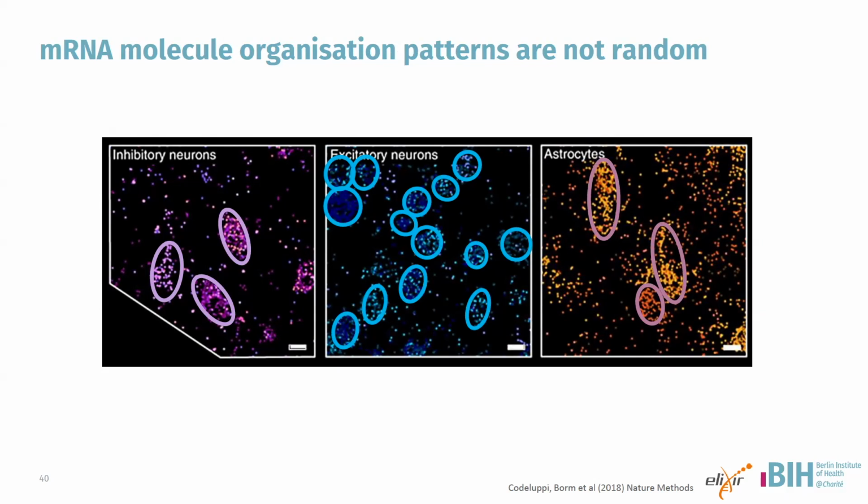So using transcript density as a very simple proxy for cell locations is a very strong premise to actually try and take a cell segmentation-free approach. So not trying to draw a border around the cell, but trying to look at local transcript patterns and see if you can analyze those within their spatial context.